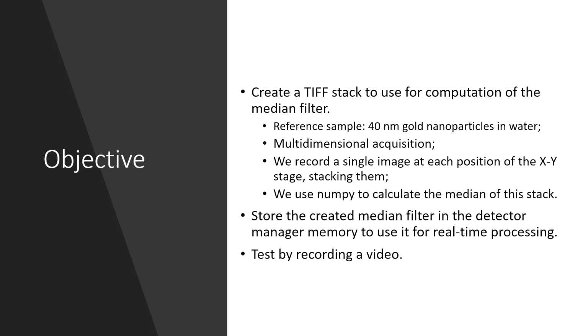So the objective of this experiment is to create a TIFF stack to use for computation of the median filter to apply to our recordings. We use as a reference sample a 40 nanometer gold nanoparticle in water. And we use this to perform a multidimensional acquisition, meaning that we record a single image at each position of the XY stage and create a stack of them.